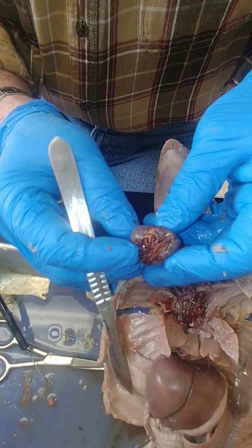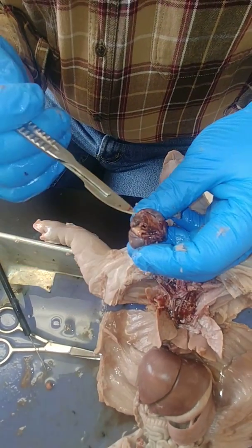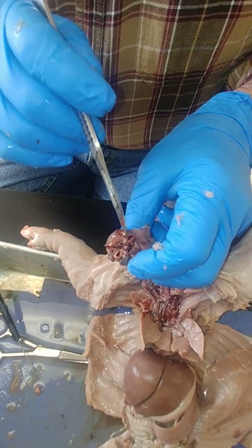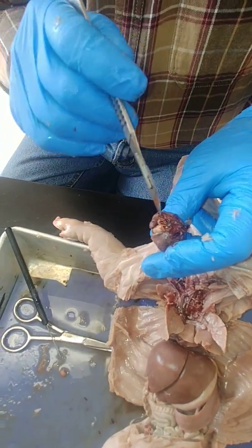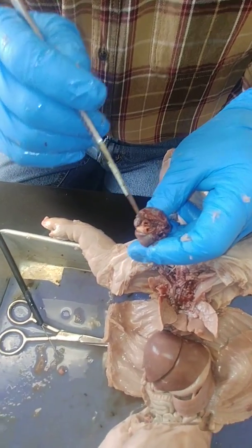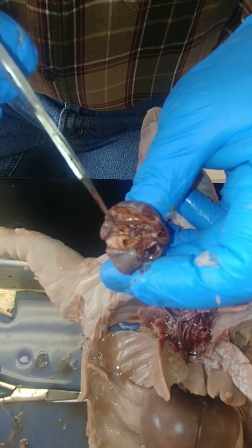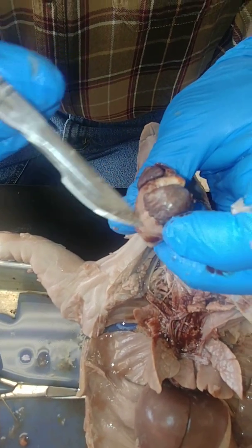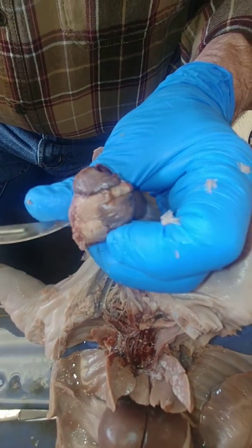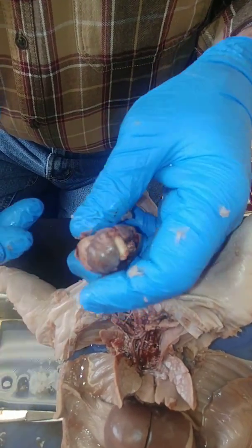Okay, now with the heart, then you can see, like I said, this was the superior vena cava coming in up here, inferior vena cava down here, aorta right here. Now we've got another little opening here. This would have been the pulmonary artery coming up from the left side of the heart, or excuse me, the right side of the heart. It would angle across in there. It's coming up from here. The aorta comes from the left side of the heart.